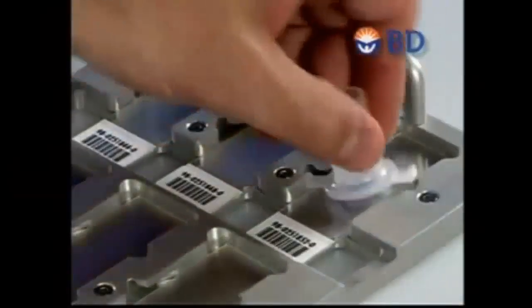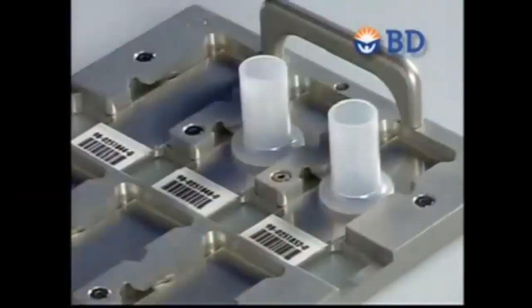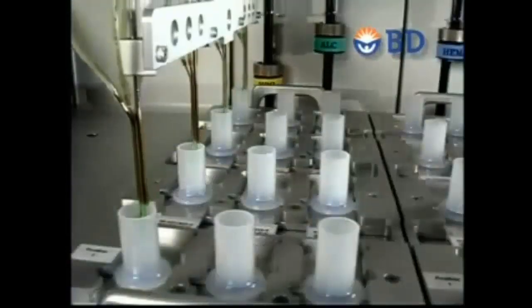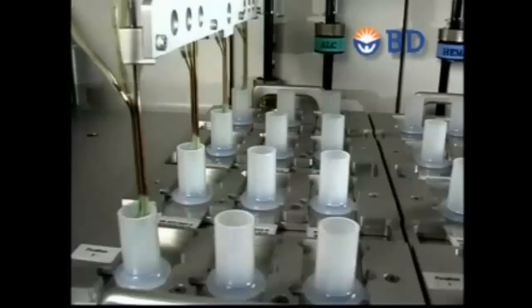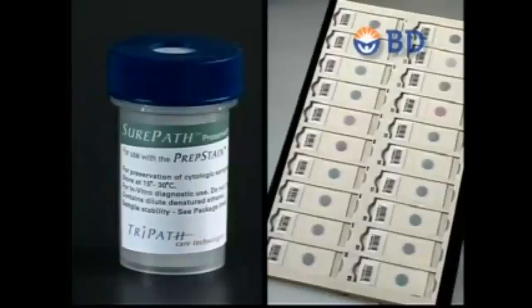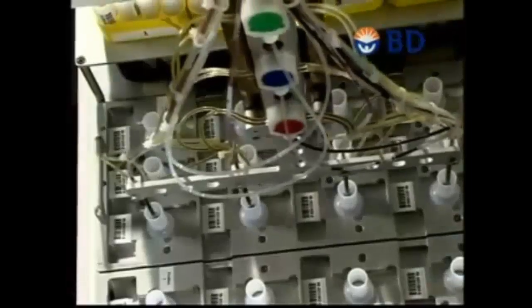Disposable settling chambers attached to the slides define the 13 mm cell deposition area where thin layer preparation and discrete staining are automatically completed by the PrepStain slide processor. Multiple slides can be generated from one specimen if desired, which is useful for processing non-gynecological specimens and for performing repeat testing. Once the slide racks are loaded onto the PrepStain, automated slide processing can begin.